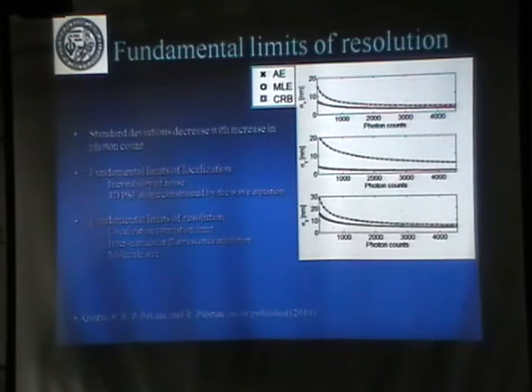Okay. What's the probability distribution you use for computing this kind of bound? This is with the Poisson distribution, because that's the only noise that you cannot eliminate. It's the one that depends on the photon arrival. Light is photons, and that is something you cannot change.